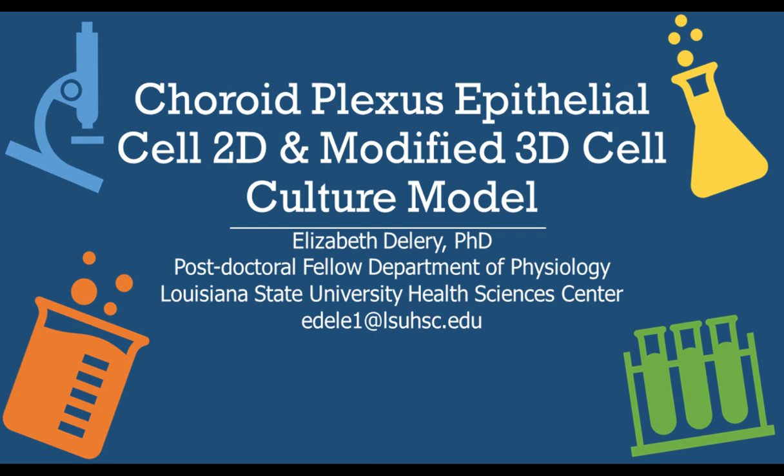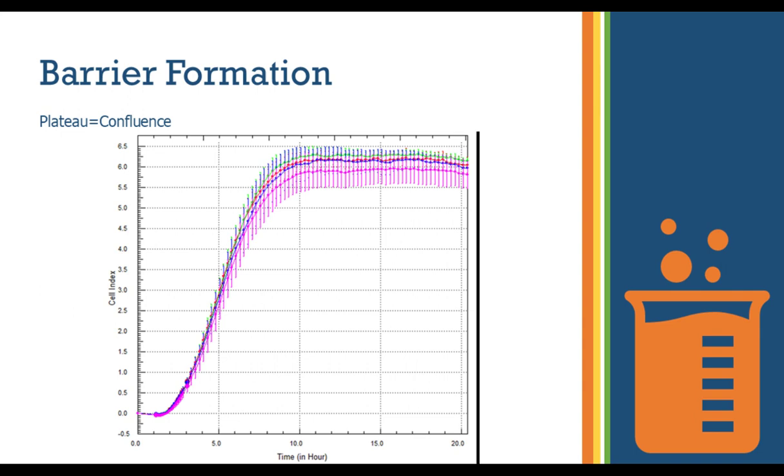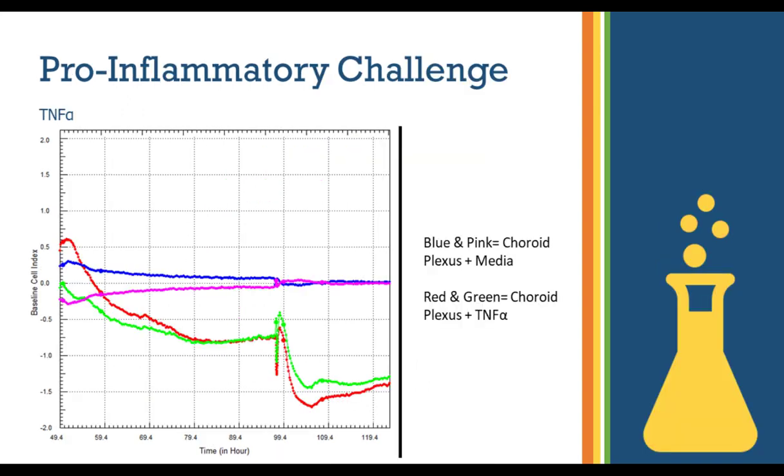Oh, awesome question. So for xCelligence, we're lucky in that it's a 16-well plate. And as you remember from some of the pictures, let me pull up so I can show you right now. You can see 4 lines here, and obviously 16 divided by 4 is 4. So we had 4 separate wells for each condition, and they were averaged together to produce these lines. When you see the long vertical lines here, that's actually the standard deviation on the graph. They were a little bit messier for some of the other ones, which is why I wanted to do just the lines themselves. But that's 4 replicates for that one right there.